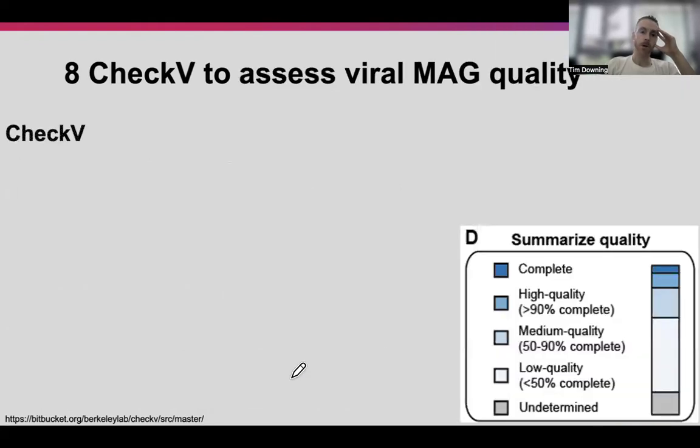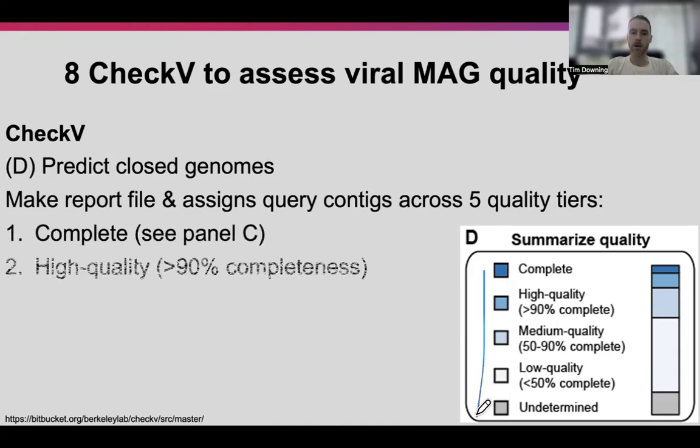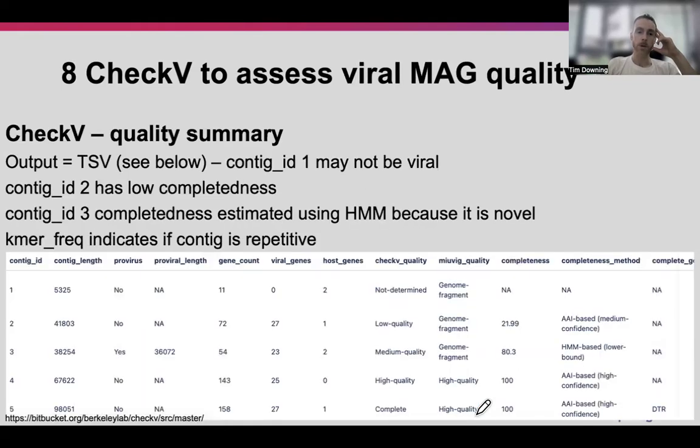Finally, you can put together a summary report on all these different things to identify how good the genomes are. If they're complete genomes, most of the time we'll find that it's rare to get complete genomes, and we're unlikely to do so in our practical at least. So what you can see here is the summary table of the quality. The report is in a TSV format.